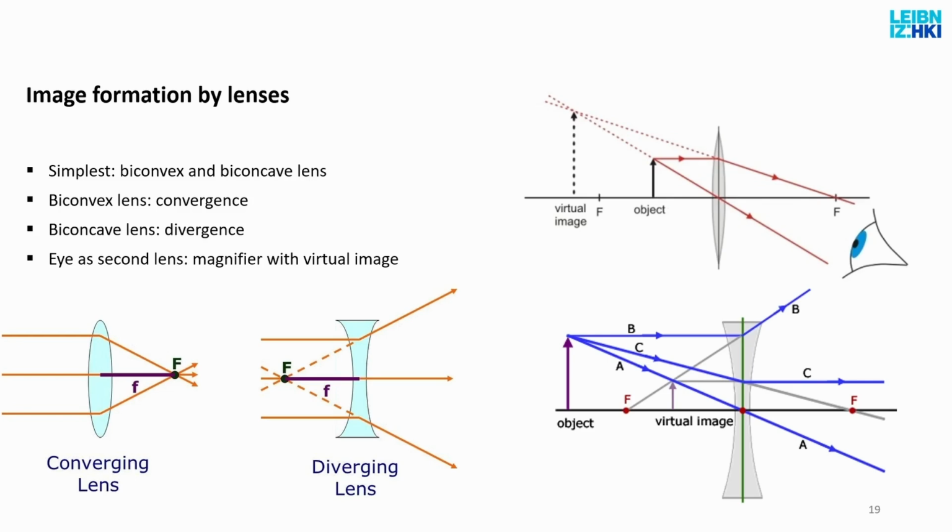The same principle is true for lenses which are formed by concave surfaces, except that the light beam which goes parallel to the optical axis will bend as if it was coming from the focal point. It will diverge. And the light beam that goes through the center will go undisturbed as before.